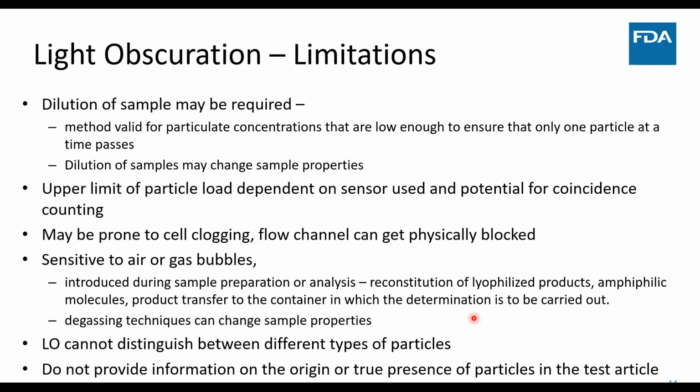Another important consideration is that the instrument is very sensitive to air and gas bubbles. So when you're analyzing products such as reconstituted lyophilized product or amphiphilic molecules, you want to be careful about how you analyze them. It's always important to degas before you do sample analysis. However, the degassing technique can change sample properties. Once again, that's another topic, and I'll add more to it in the next slides.